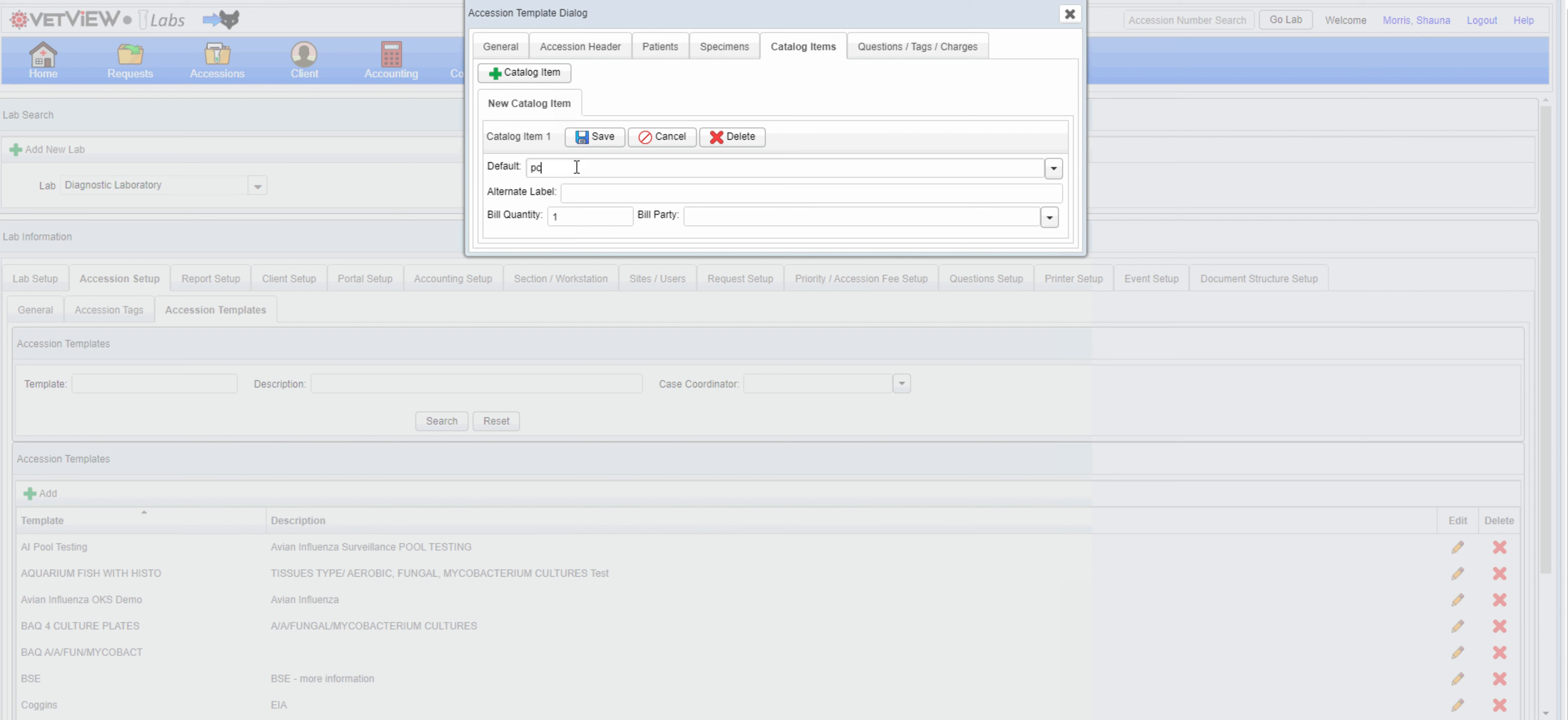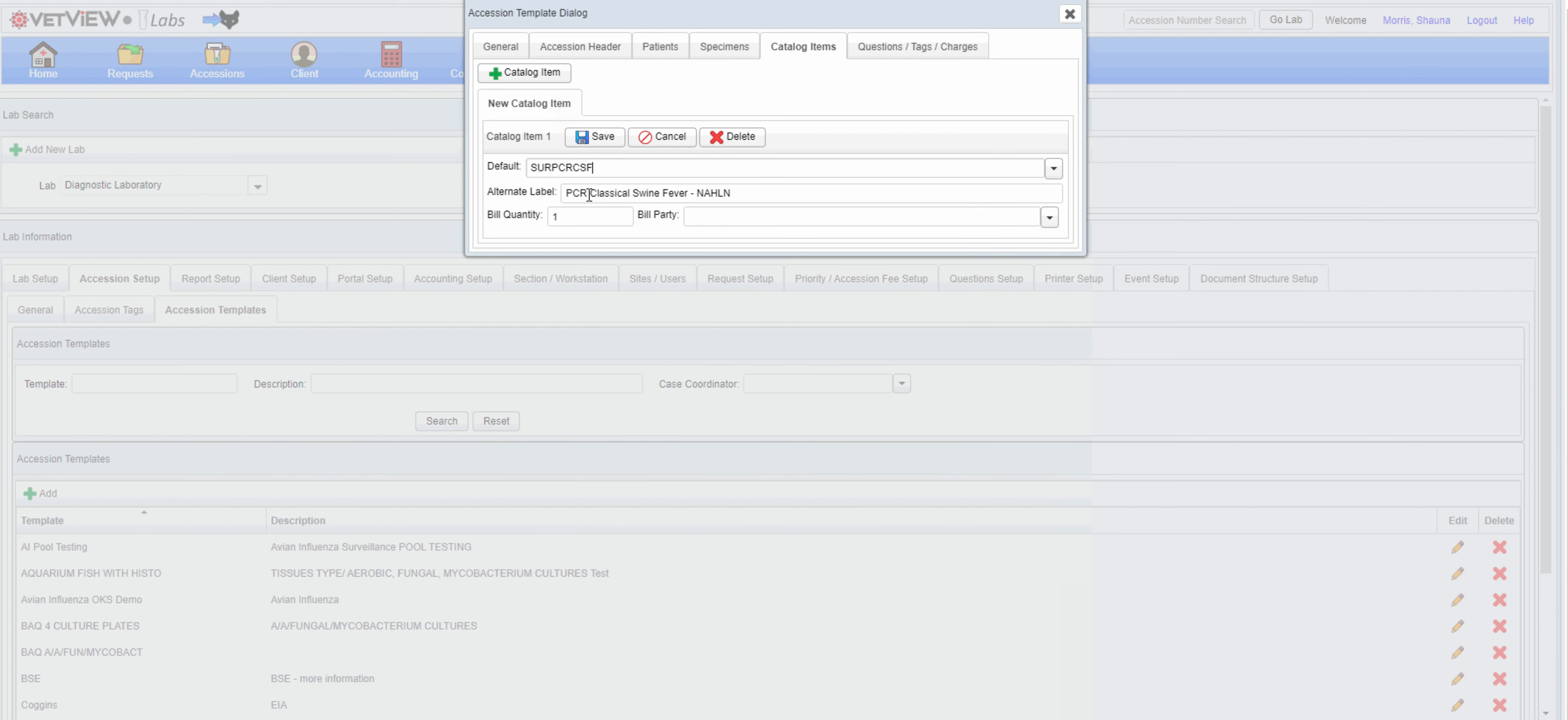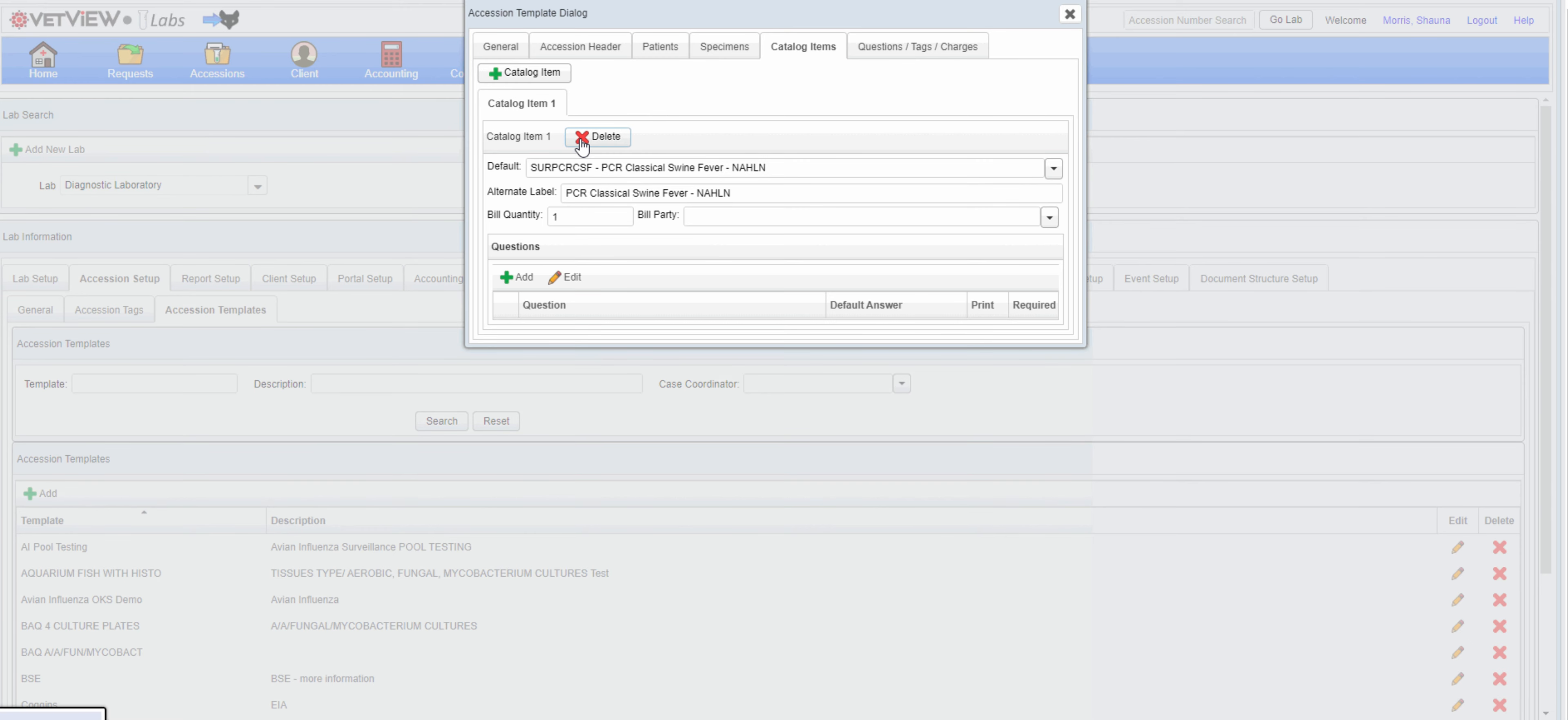If desired, the catalog item can be pre-populated in the template. This will automatically add any questions related to that test.